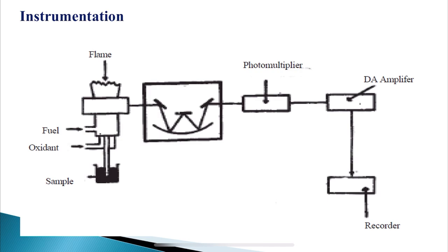Once it comes in contact with the flame, the nebulizer is going to produce a mist or aerosol. That capillary tube, using a jet of air at high pressure, will aspirate or suck the sample solution. The mixture of fuel gas, oxidant and aerosol of the test solution moves towards the burner head. This is how the nebulizer or the burner assembly works.